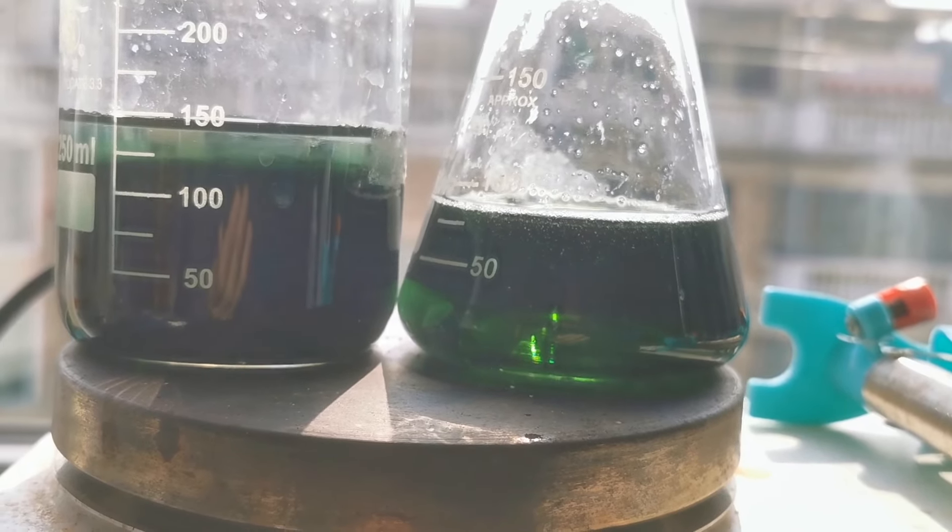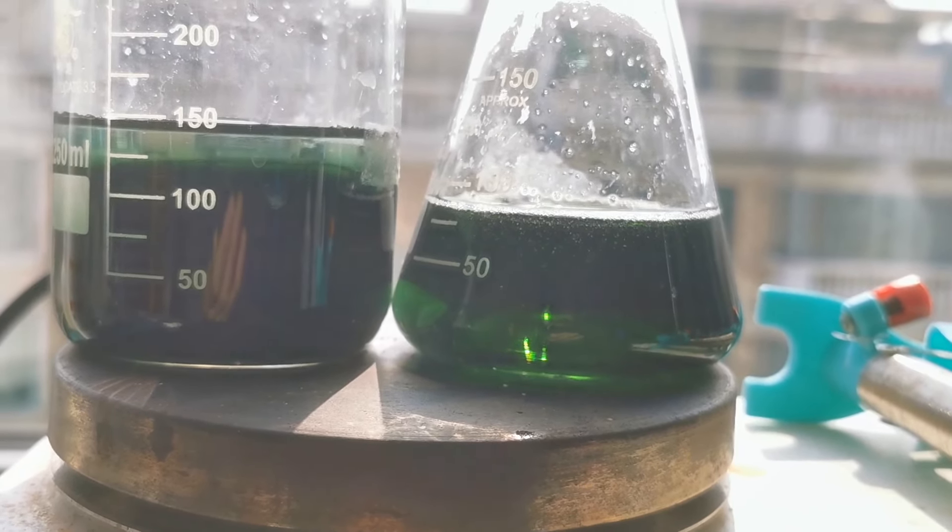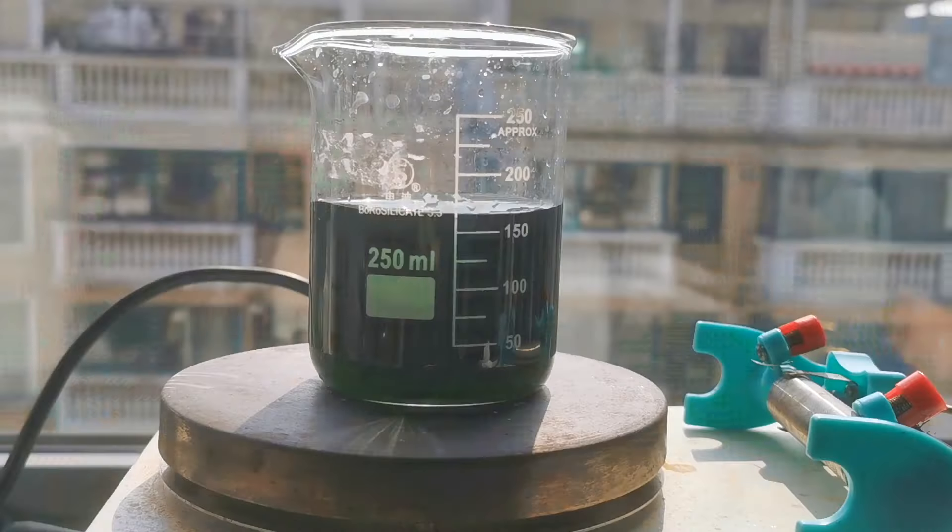But the nickel concentration in the bath doesn't have to be exact. Other variables such as temperature and pH are more crucial in the process. After I felt that the two solutions looked the same, I mixed them up and now I have 250 mL of nickel electroplating bath ready.